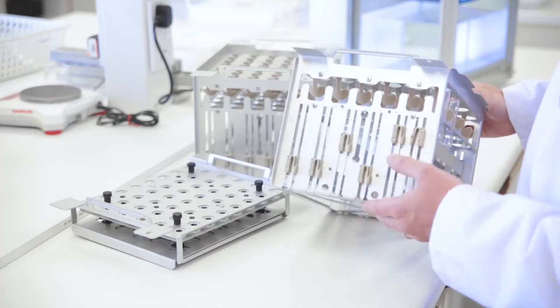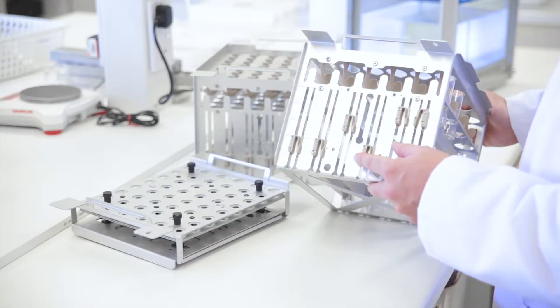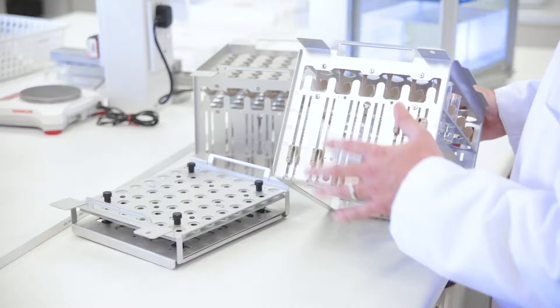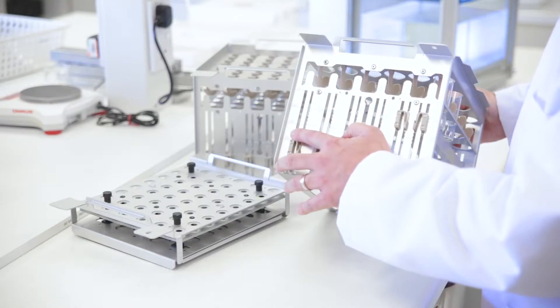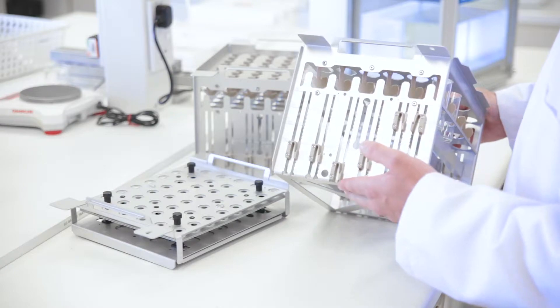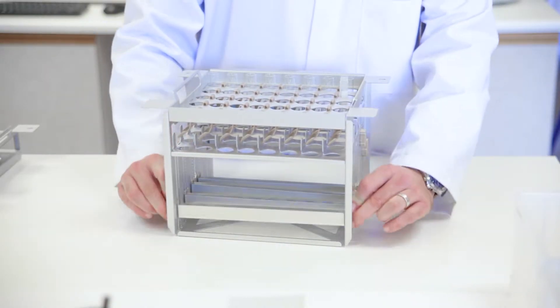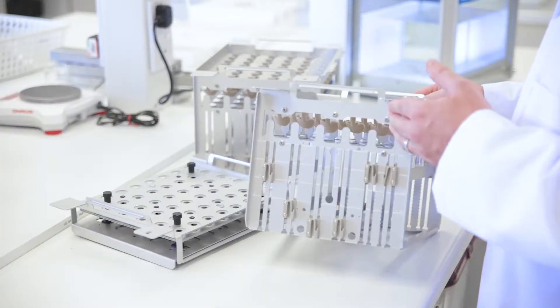This is made possible by use of these height adjustment handles. Depending on the length of your vial, we've got a graduated scale on the side of this rack, and you can move this height adjustment bar upwards and down to deal with different vial lengths.